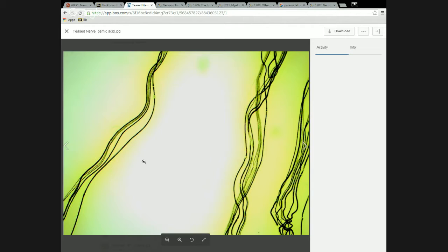We can see one right at the edge of the screen here for this fiber. If we follow that fiber along, there's its next one. And if we follow it along further, I think it's this. I would have guessed that the next one would have been right about here, so it might be covered up by this fiber, or it might be just off the screen. We can see a gap right there, and if we go up this fiber to this side or down this way, we never get to the next one on that fiber, because whichever direction we go, it would be off the screen from the one in the middle there.